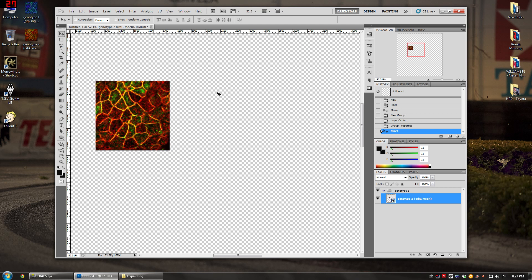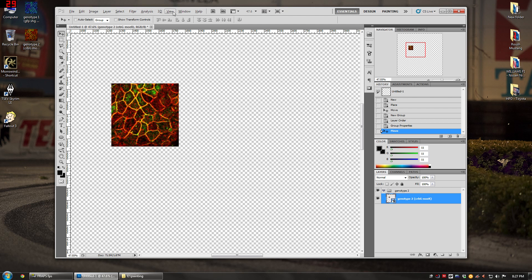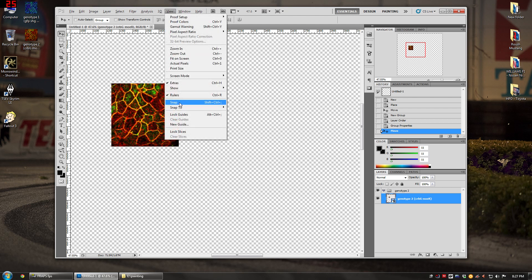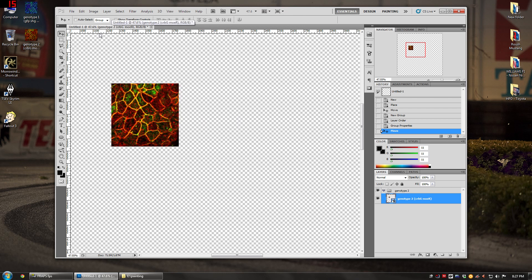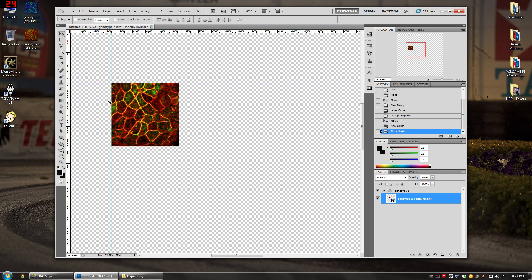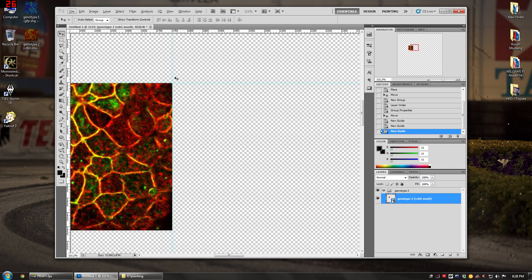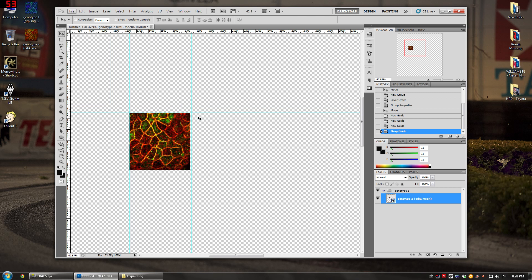Before isolating colors, I set up the basic grid for the figure. Go to View > Snap and turn it on, then go to Snap To and select all. Press Ctrl+R to turn the rulers on, then click and drag from the ruler to drop a guide — it'll snap to the edge of the image. Drop guides to border the image and mark where the next image will go.